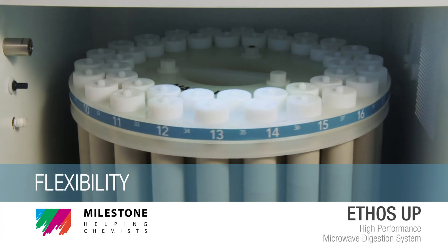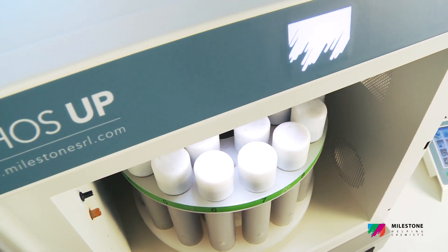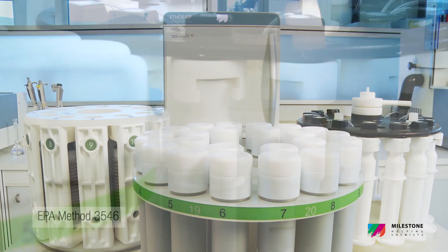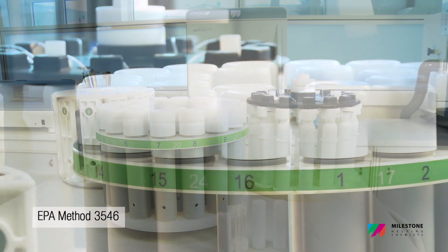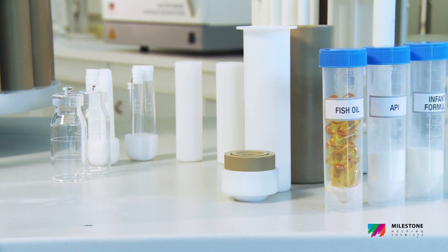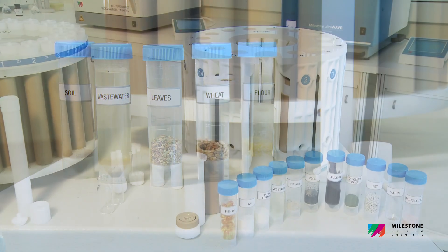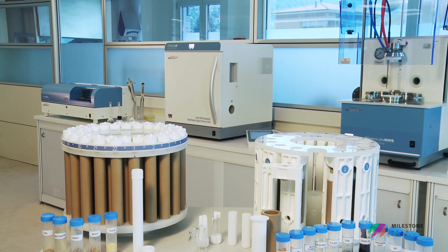Flexibility. The Ethos Up embraces Milestone's philosophy of a microwave lab station as it is suitable for the extraction of pollutants from environmental matrices in full accordance with US EPA 3546 and for the determination of total fat from food samples. In addition, a wide variety of digestion inserts and rotors are available to match specific needs or applications. In a single platform, the Ethos Up is the combination of ease of use, performance, productivity and reliability.